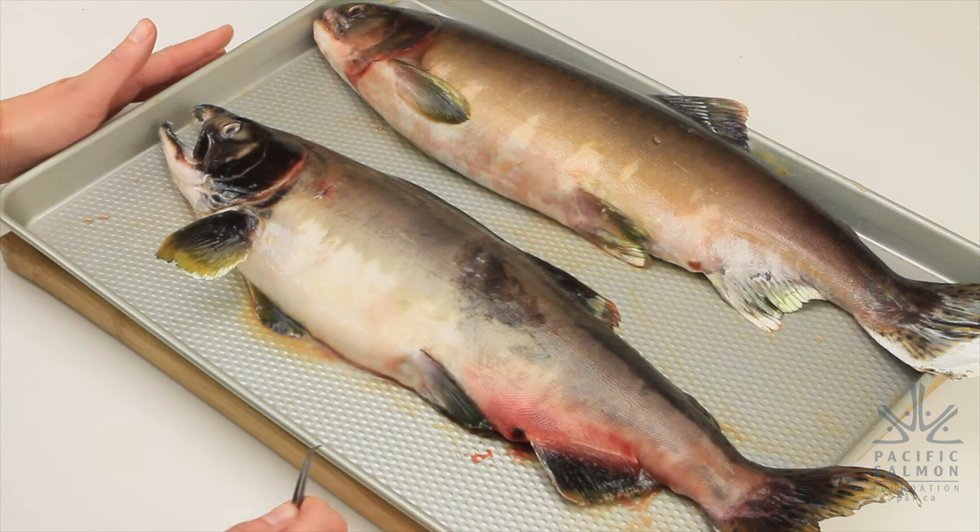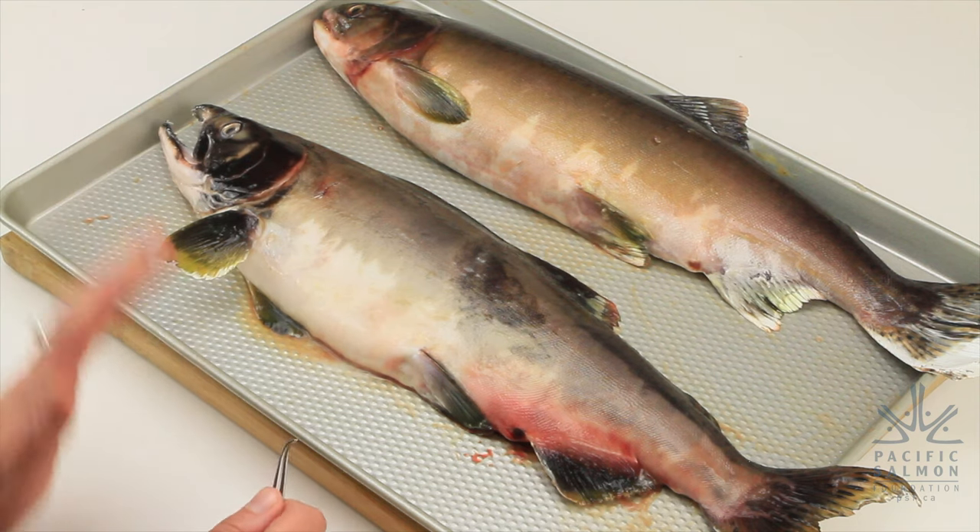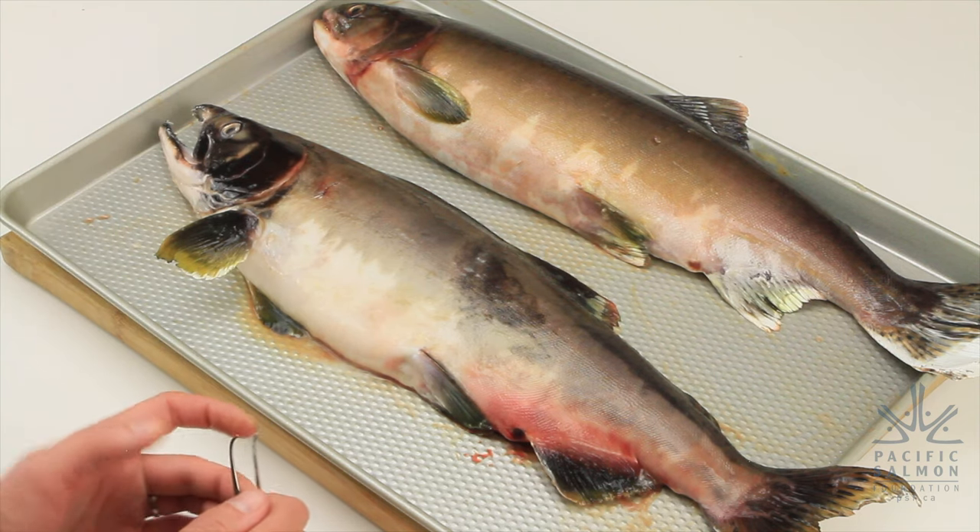Hello everybody, my name is Nicole Fredrickson and I work as a biologist for the Pacific Salmon Foundation. Today we are here on Vancouver Island and we are going to be talking about some of the features of Pacific Salmon. Specifically, we'll be looking at these pink salmon, examining their external features and discussing the functions of those features, and then we're going to cut the fish open and do a dissection of their internal organs.